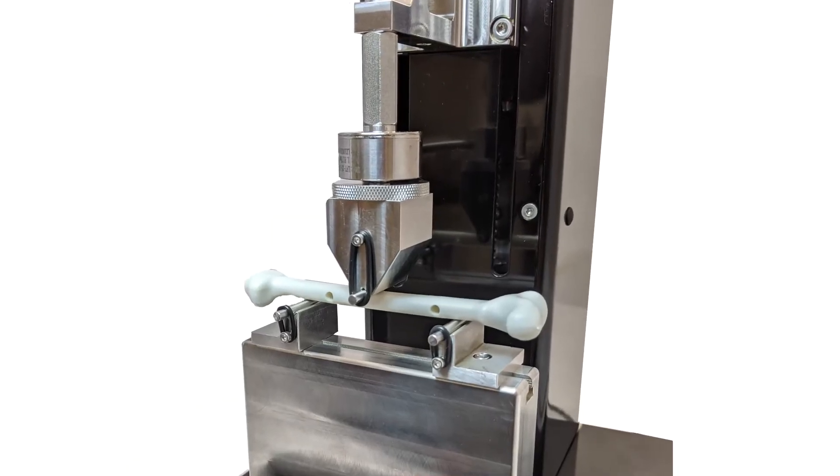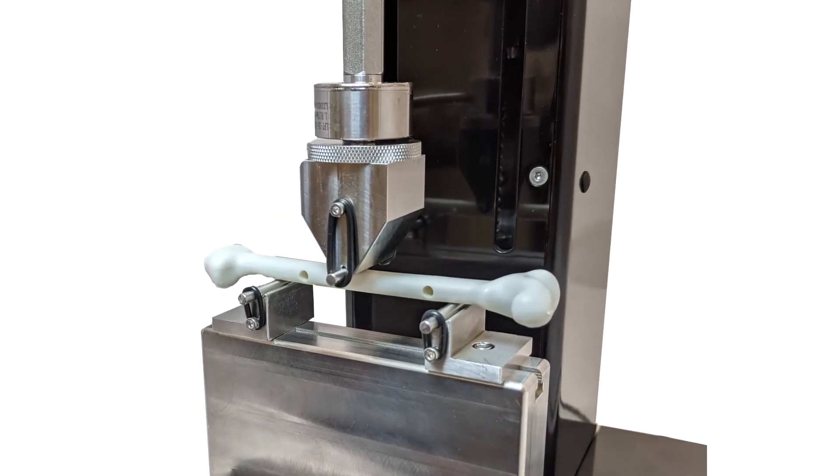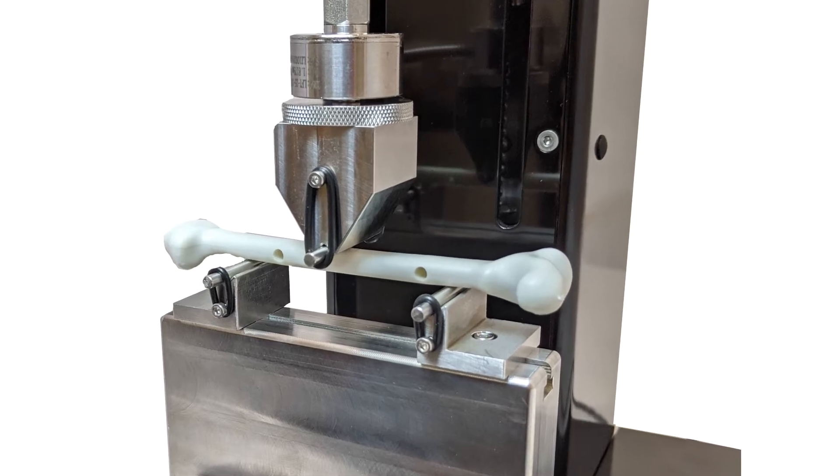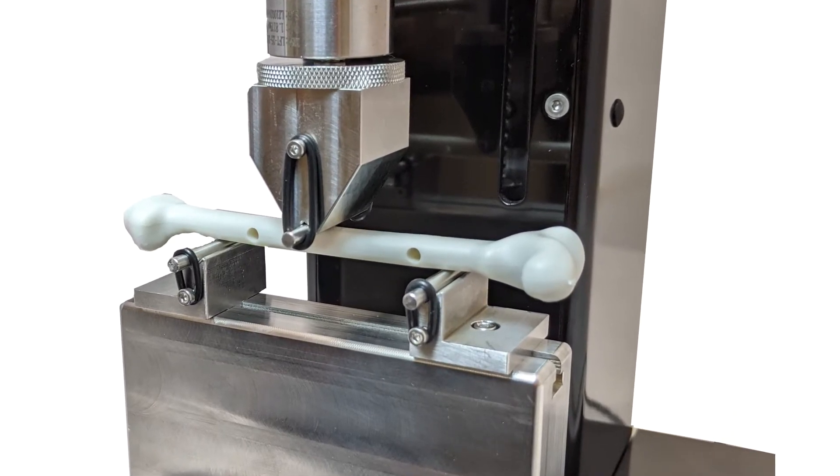And likewise, three-point bending where the fixtures are replaced by fixtures that can be adjusted to give different types of three-point bends.